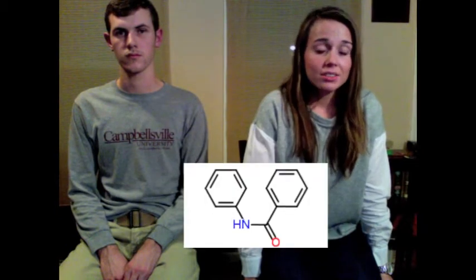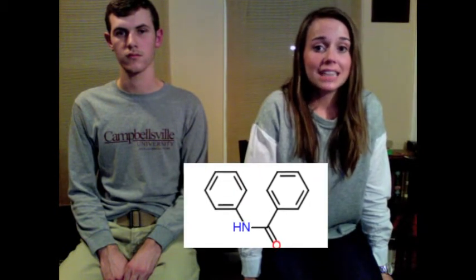The range of peaks between 3,650 and 3,750 are in the range for an N–H bond. This also could have been due to error or extra noise in the IR spectrum trial. Based on the functional groups, along with the viewing of the typical IR spectrum, it is hypothesized that the unknown is benzanilide.